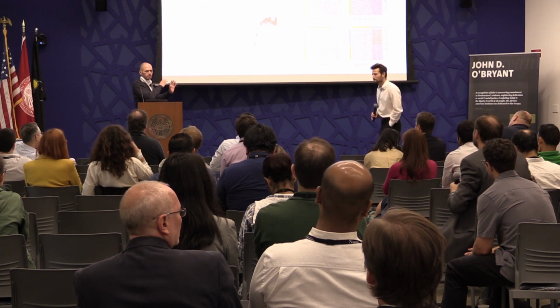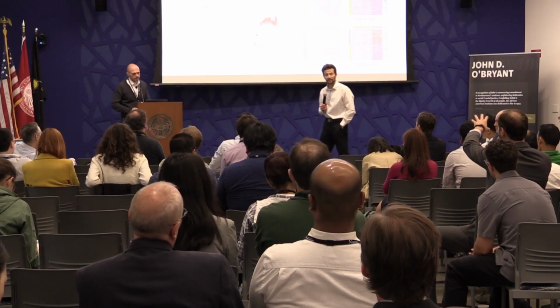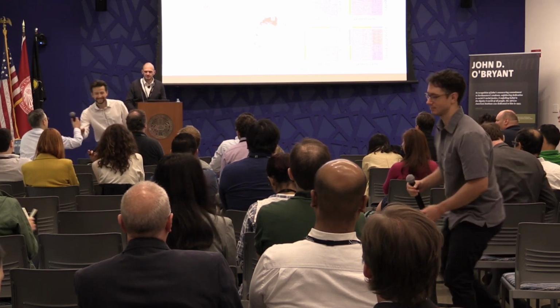Yeah, I would not take some kind of conceptual message from this. This is purely technical. If you're trying to align the data sets, how well does a signal match up? The reasons why it does or does not match up can be more complicated. I think that we need to think more about it. No, it's a great data. The first two squares clearly show that there is a beautiful correlation there. So central dogma holds. I think it looks amazing.